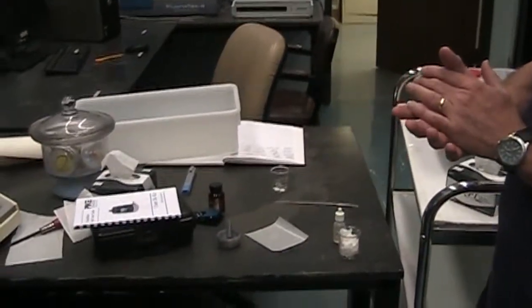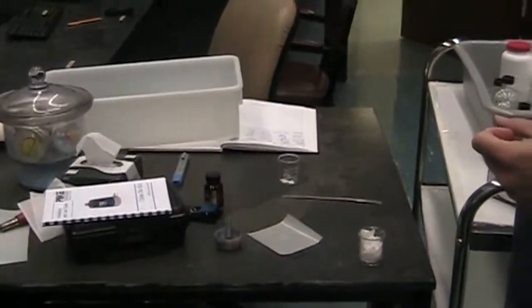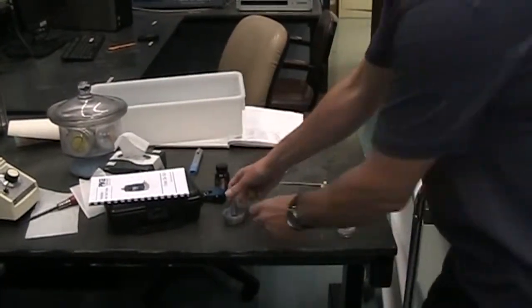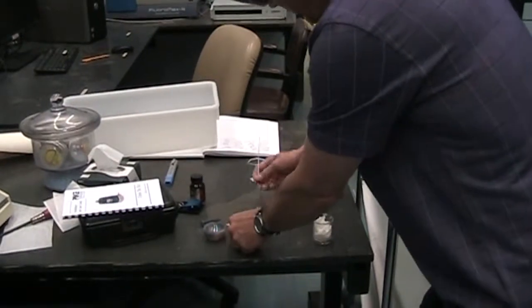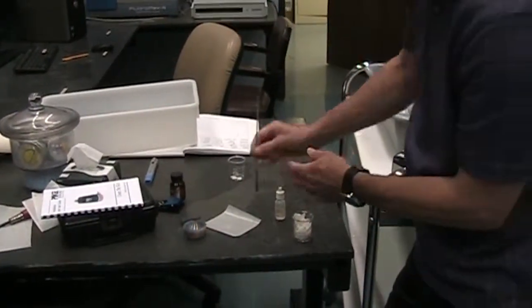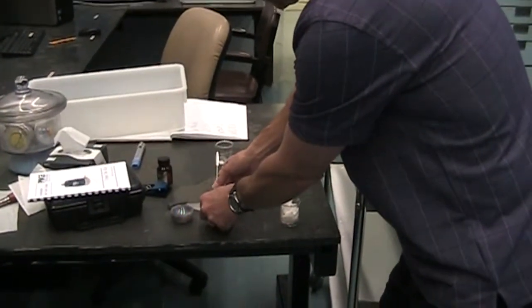Again, when you have a solid sample, it's called a mull. And we have some Nujol, which is just a type of mineral oil, and you take that in some of your sample. Again, you're going to grind that together a bit. You don't want to touch it with your hands. If you want to pick it up, you should wear rubber gloves because this is salt plate, so it will dissolve if you touch it.